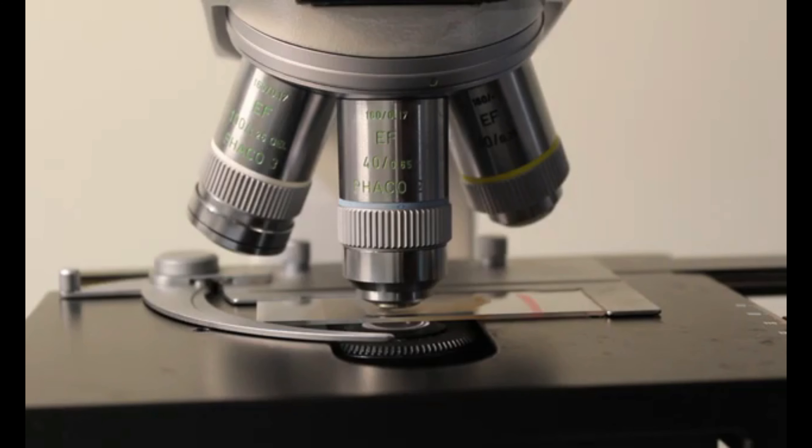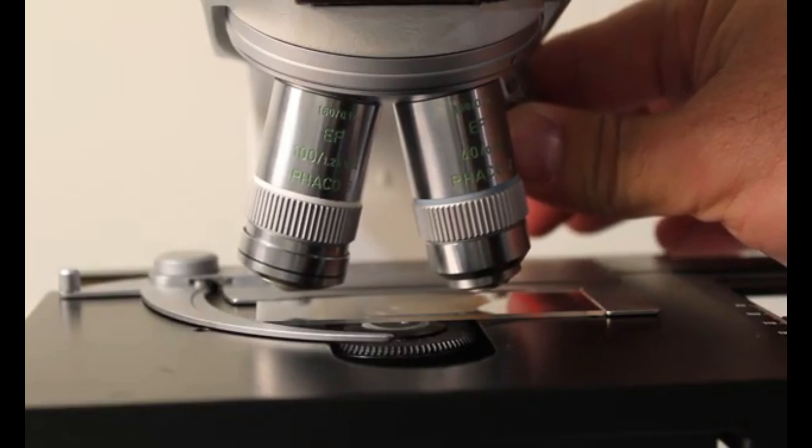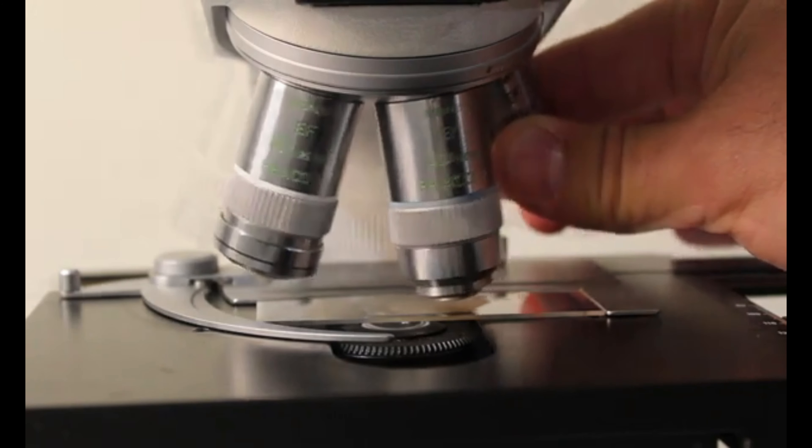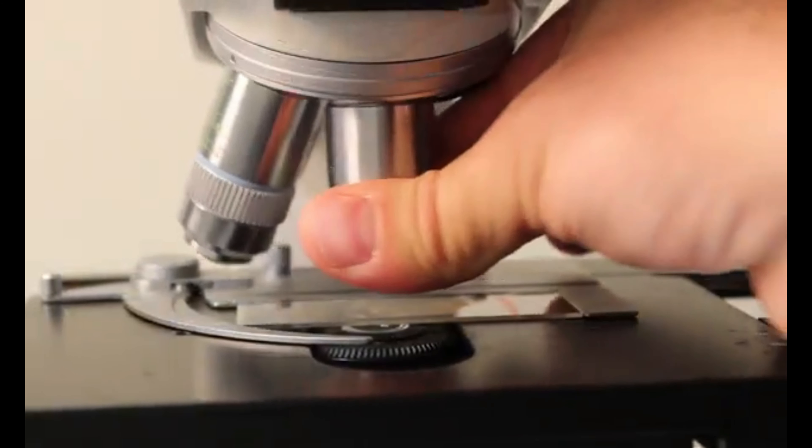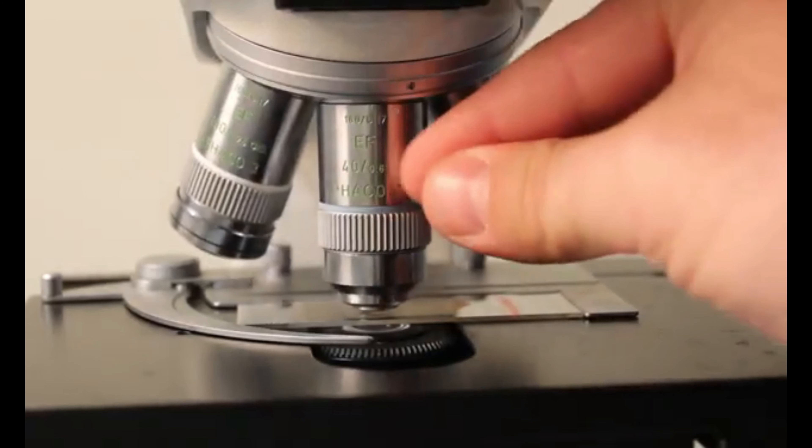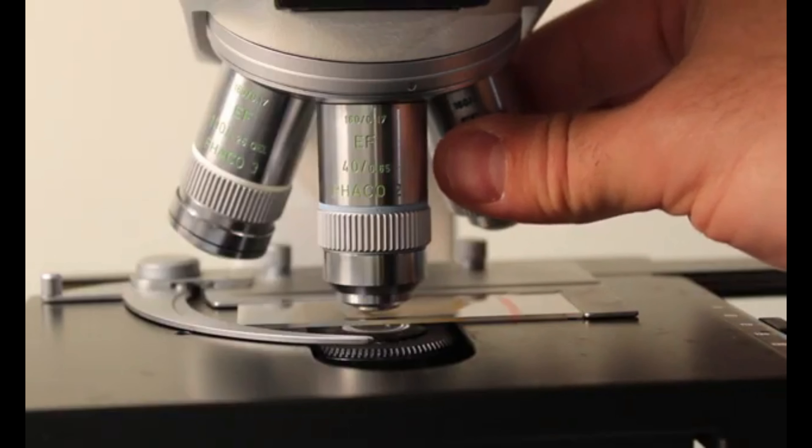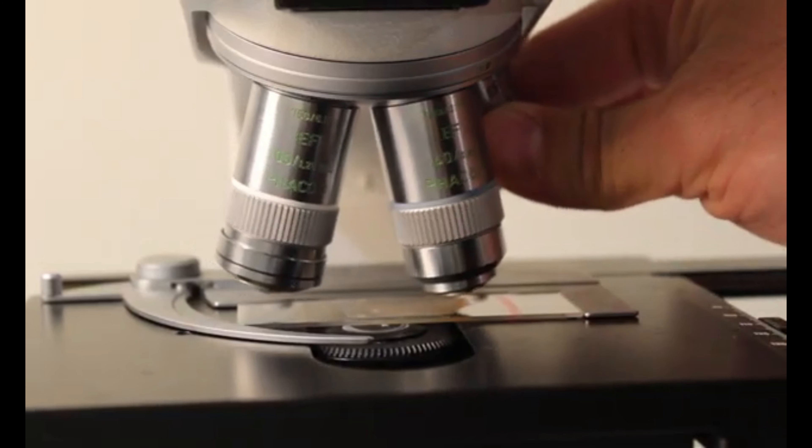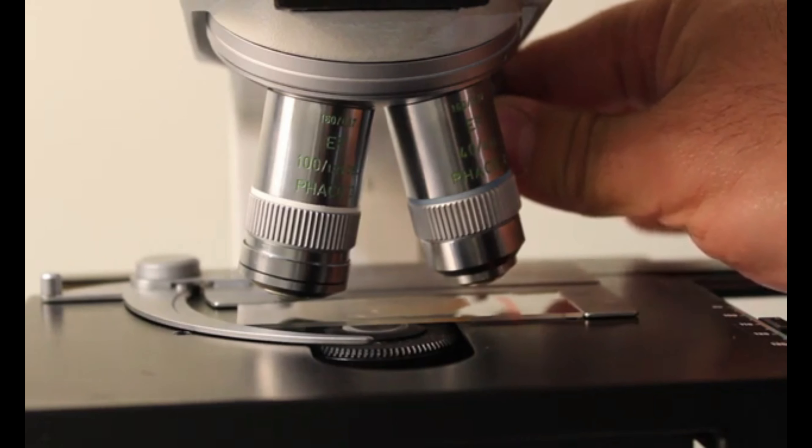Now, one thing that is important is whenever you're switching between air lenses, so that is lenses that image the sample with nothing between the lens and the sample itself, you want to be very careful not to rotate in an oil or a water objective lens. Because if you do this incorrectly, you could damage your most expensive lens on your microscope. Ideally, you should have your microscope configured so that you can rotate in the same direction from your lowest magnification lens to your medium magnification lens or medium magnification lenses and have your oil immersion lenses or your highest magnification lenses at the end of that rotation curve.